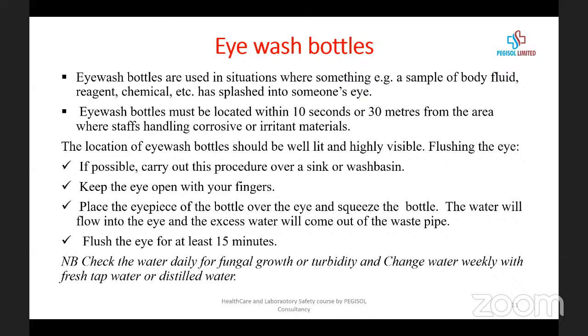Check the water daily for fungal growth or turbidity or change, and change the water weekly, with fresh tap water or distilled water as the case may be. So this is to ensure the safety of the water which you are using for the eye wash station or for your eye wash bottles.